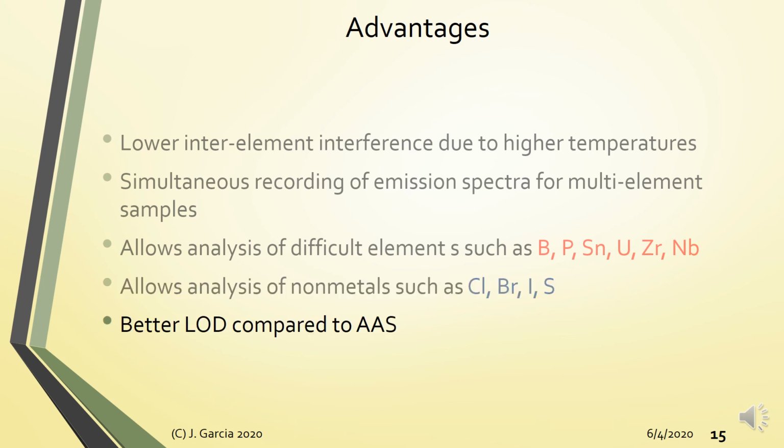And compared to AAS, plasma and electrical spark methods have lower LOD. So again, lower LOD is better. Lower LOD, hence higher sensitivity compared to AAS methods.